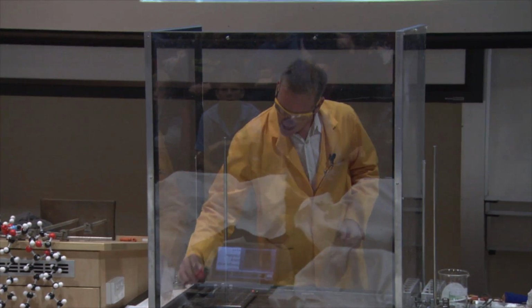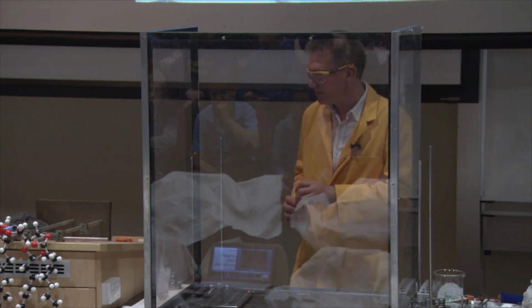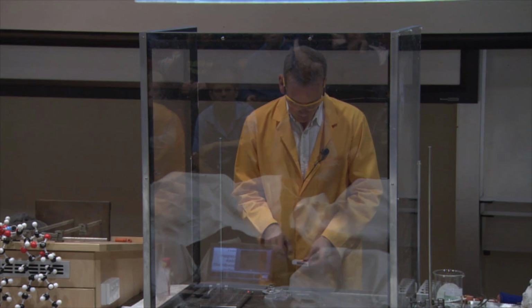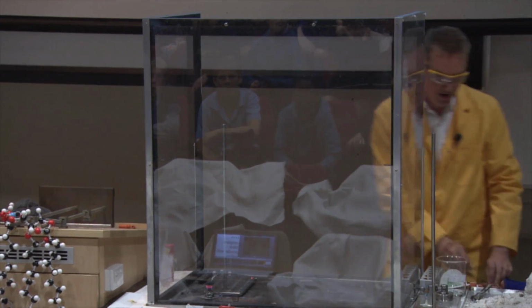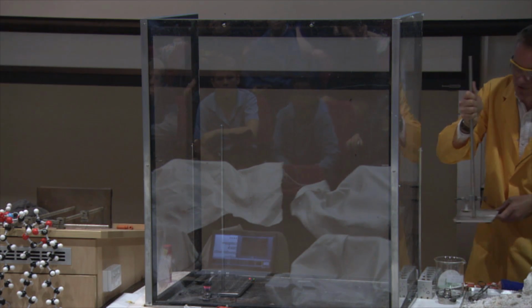Now, I have some gunpowder here, and I'm just going to sprinkle it on this spoon. And I have a little spirit burner, and I'm going to light the little spirit burner. And put it underneath. Now I have another spoon over here, and this one has slightly different ingredients.